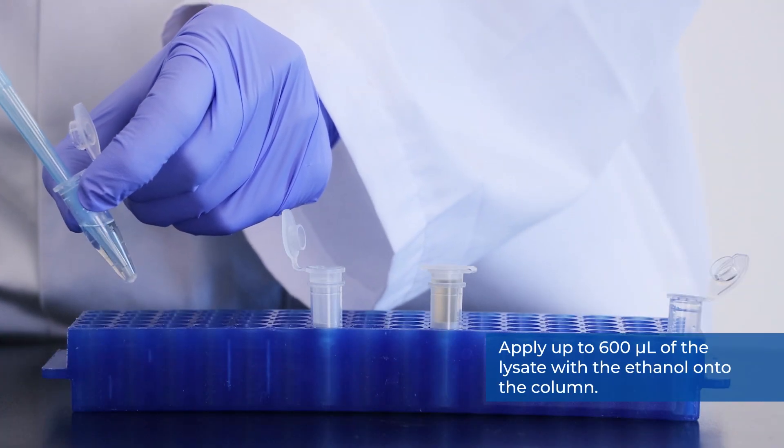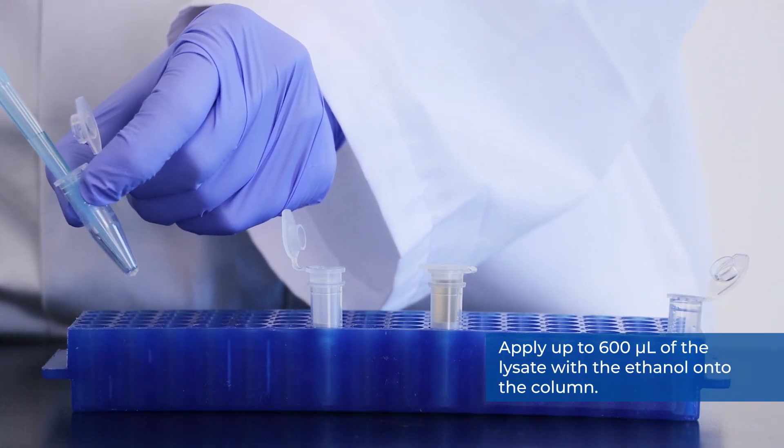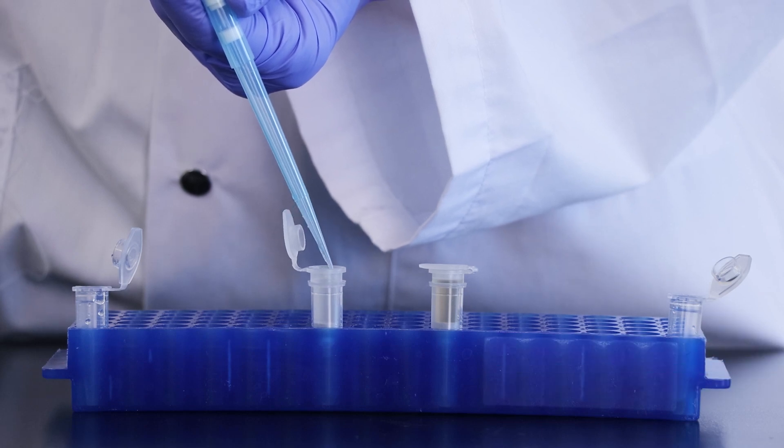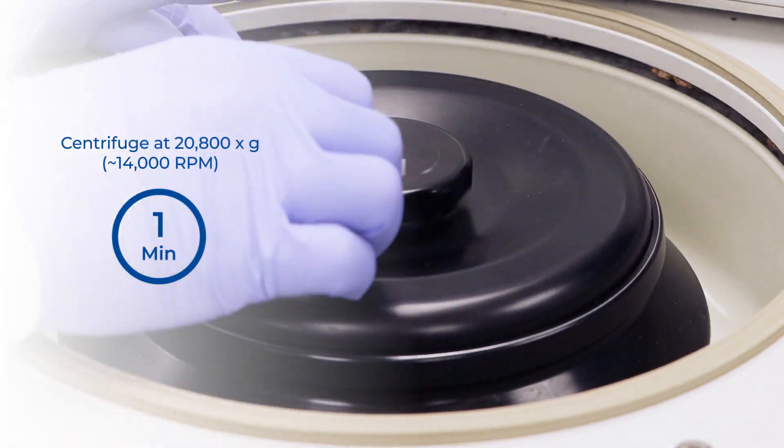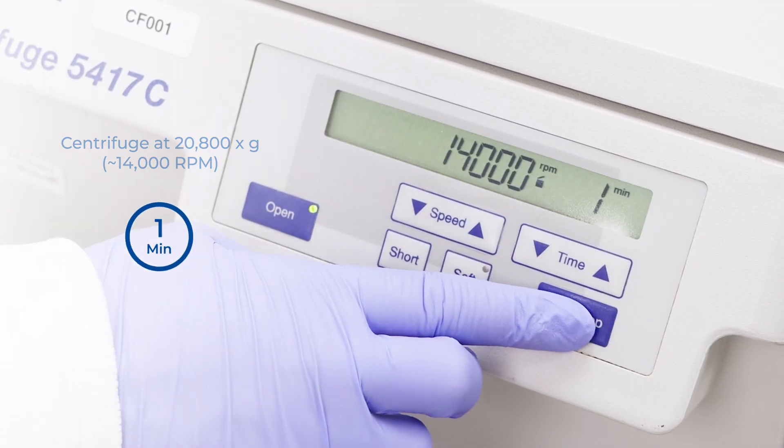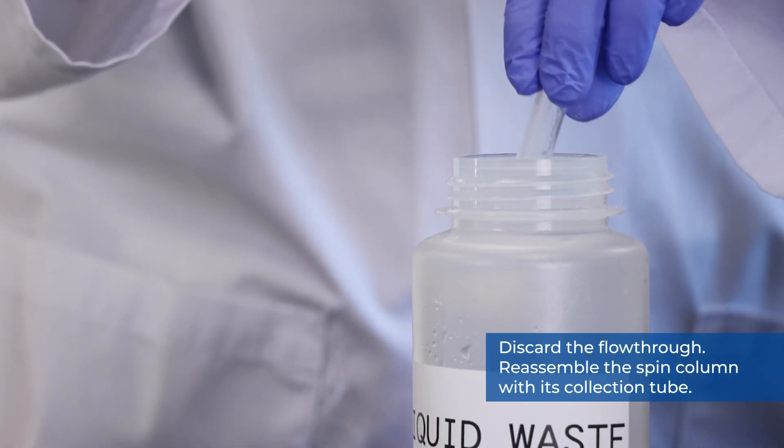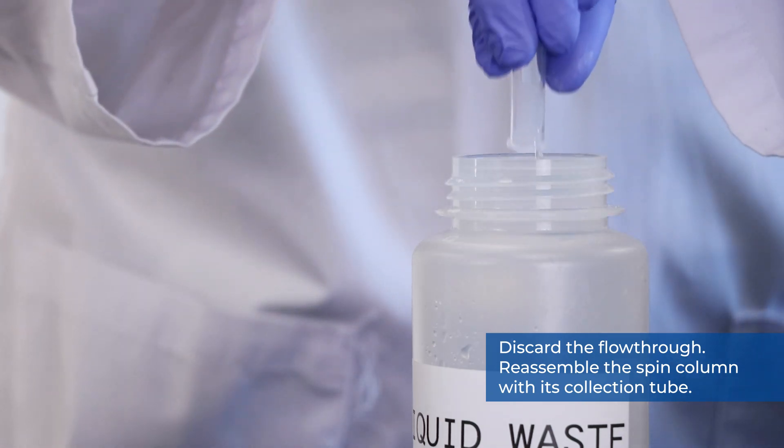Apply up to 600 microliters of lysate with the ethanol onto the column. And centrifuge for 1 minute at 20,800 G or 14,000 RPM. Discard the flow-through and reassemble the spin column with its collection tube.